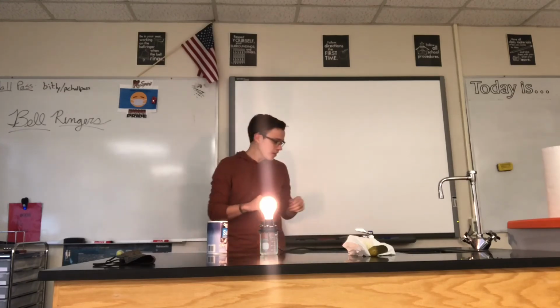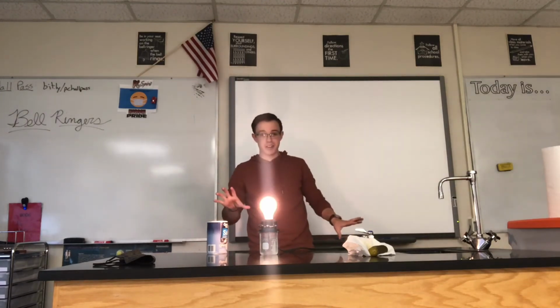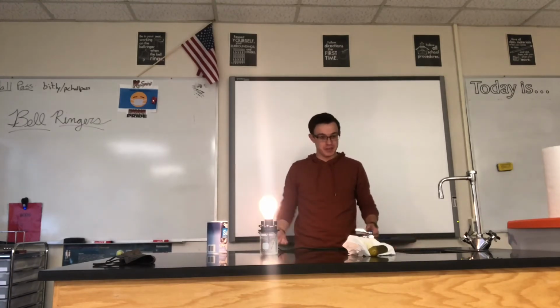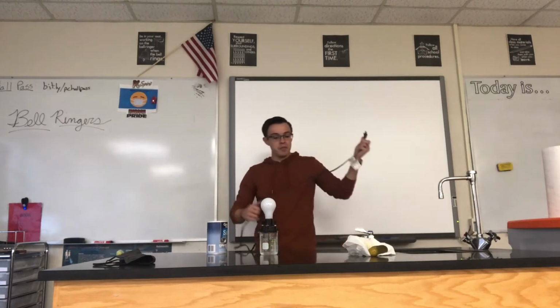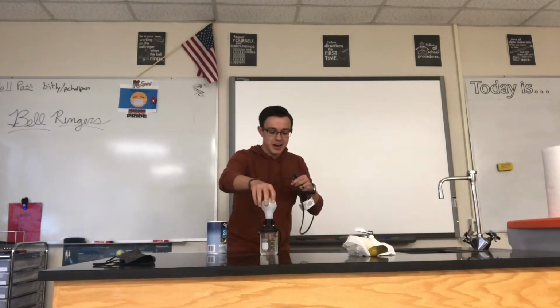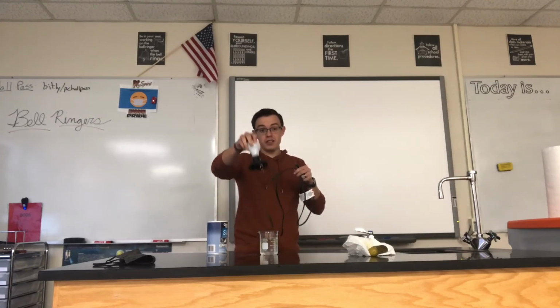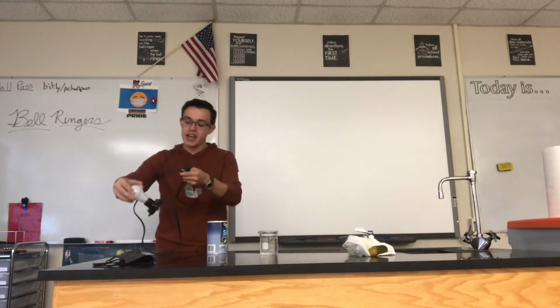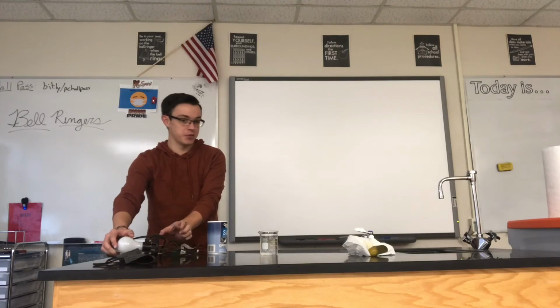Now, don't recreate that at home because we have this special apparatus set up so that it's safe for me. Don't go trying to throw your microwave in a pool or something like that, because it's not safe. Because most water still has ions in it. I used pure water, but tap water still has ions, so it actually will conduct electricity. So just be very careful. Like I said, don't recreate this outside of a lab in which I'm in that lab, okay?